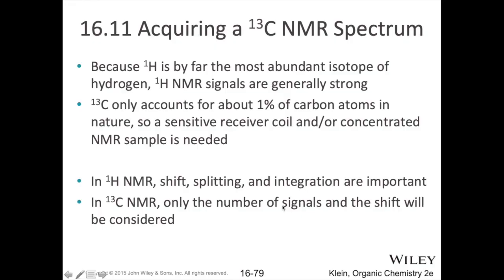Okay, so up until now we've been talking about proton NMRs. We'll end this chapter talking about carbon-13 NMRs. Now, proton NMRs are quick and easy to take. You can run a proton NMR in less than 15 minutes.